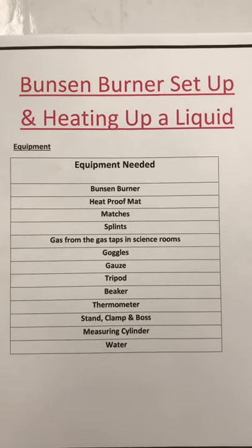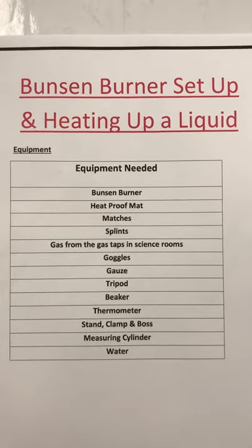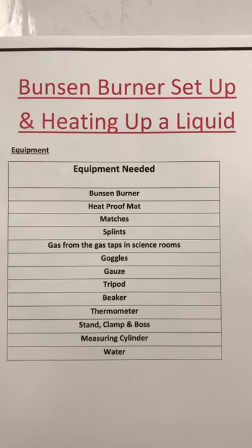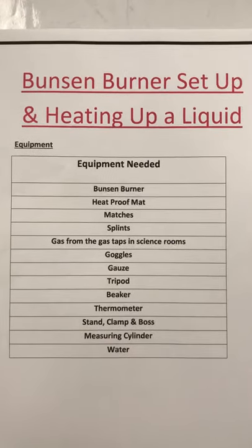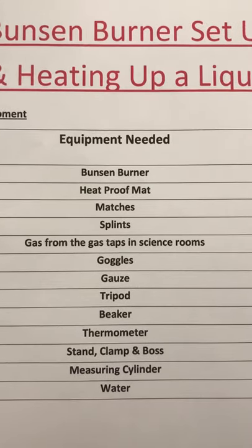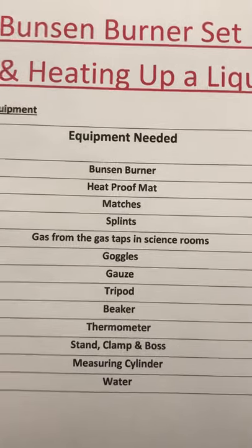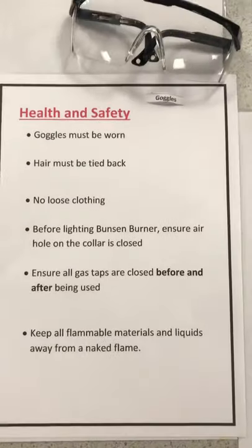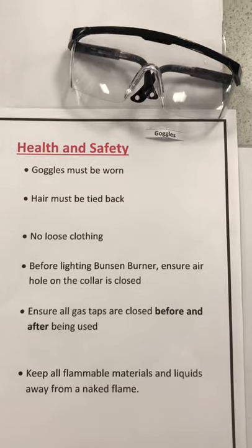In this video, we will show you how to set up a Bunsen burner and heat a liquid in a beaker using a Bunsen burner. This is the list of equipment we need to do this experiment. Before we start, make sure the risk assessment is done and you should wear goggles throughout the experiment.